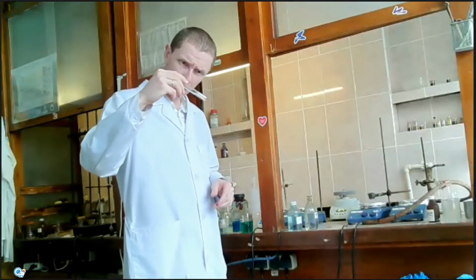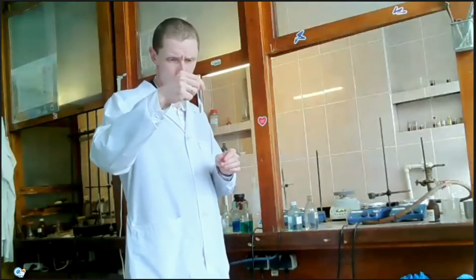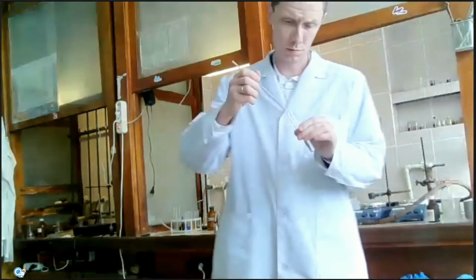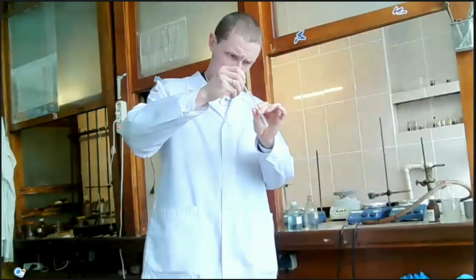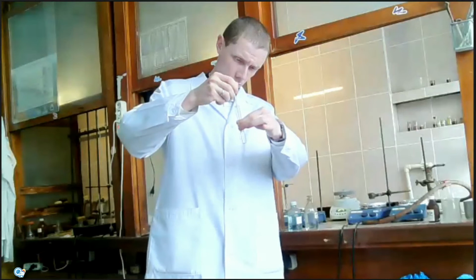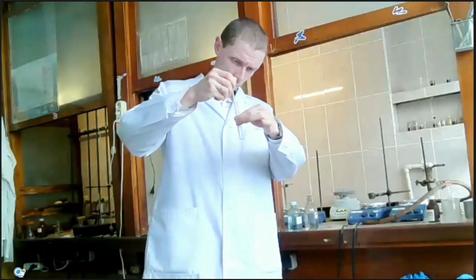Some large particles are insoluble now, but if I mix it better by using a stick, already particularly all precipitate dissolved.